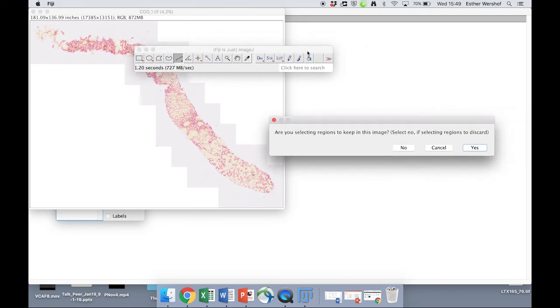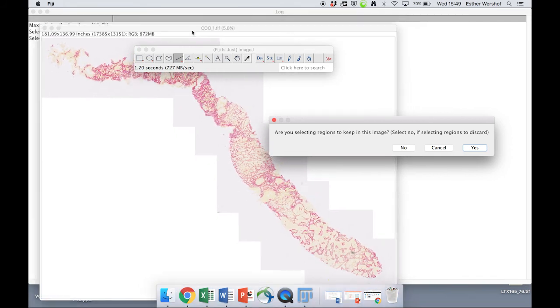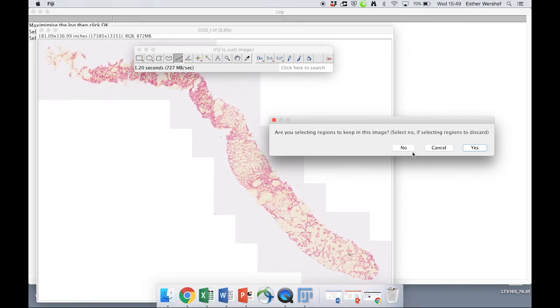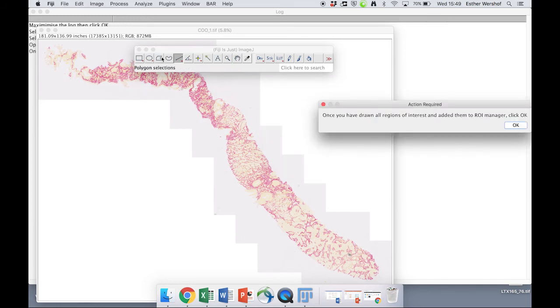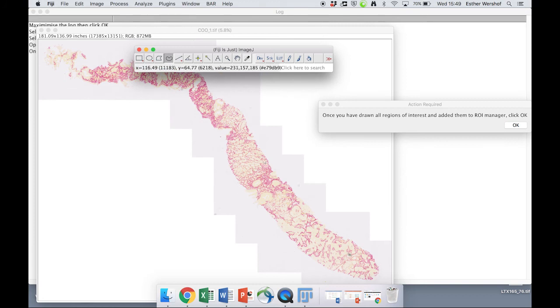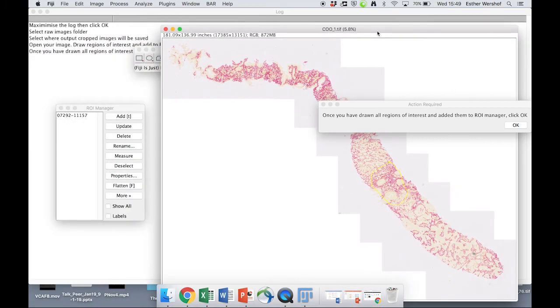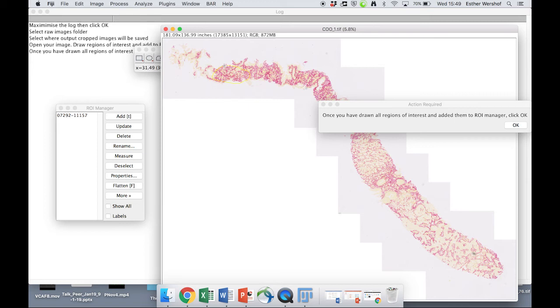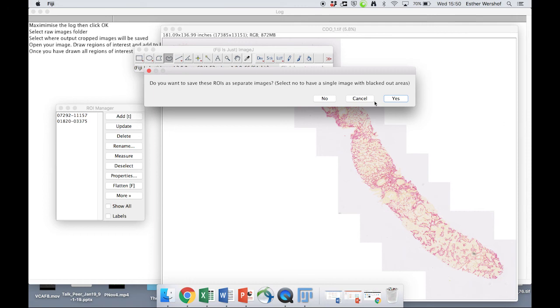Now, the image is going to open, you're going to be asked if you are selecting a region to keep or a region to delete. So let's say in this image, we're going to just keep some regions. So we're going to use this freehand tool to select a region. Maybe we're interested in this region here. And you're going to click Ctrl T or Command T if you're using a Mac, and you can see that that region of interest has now been added to the region of interest manager. Let's say we're interested in another region too, and we're going to press Ctrl T. That's also going to add to this region of interest manager. And we're happy with that, so we're going to click OK.